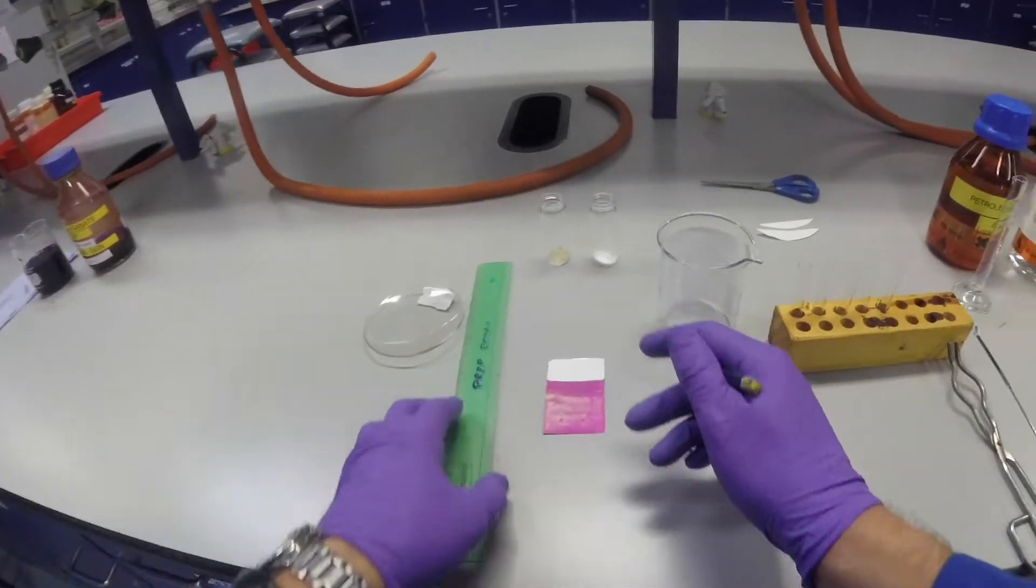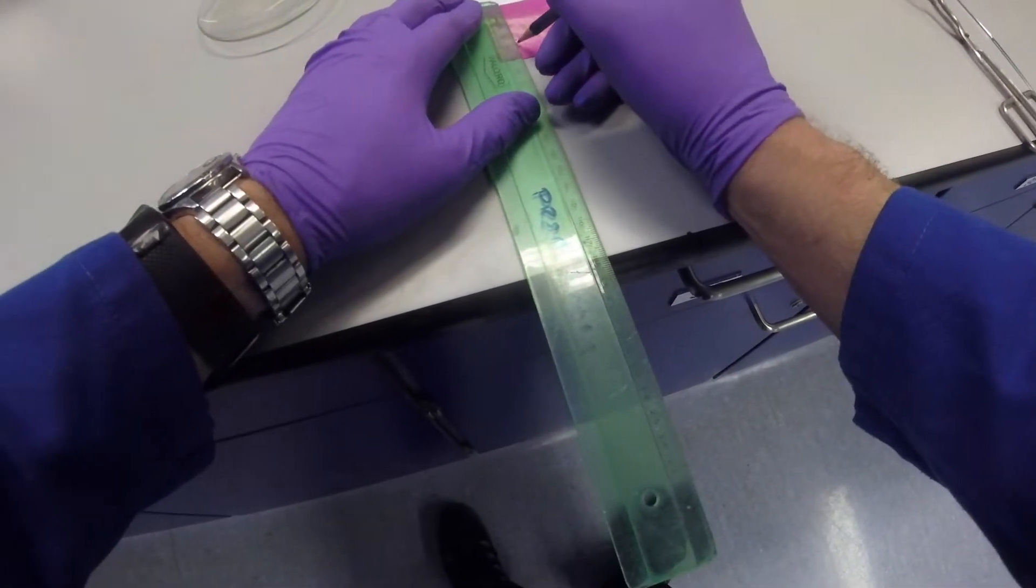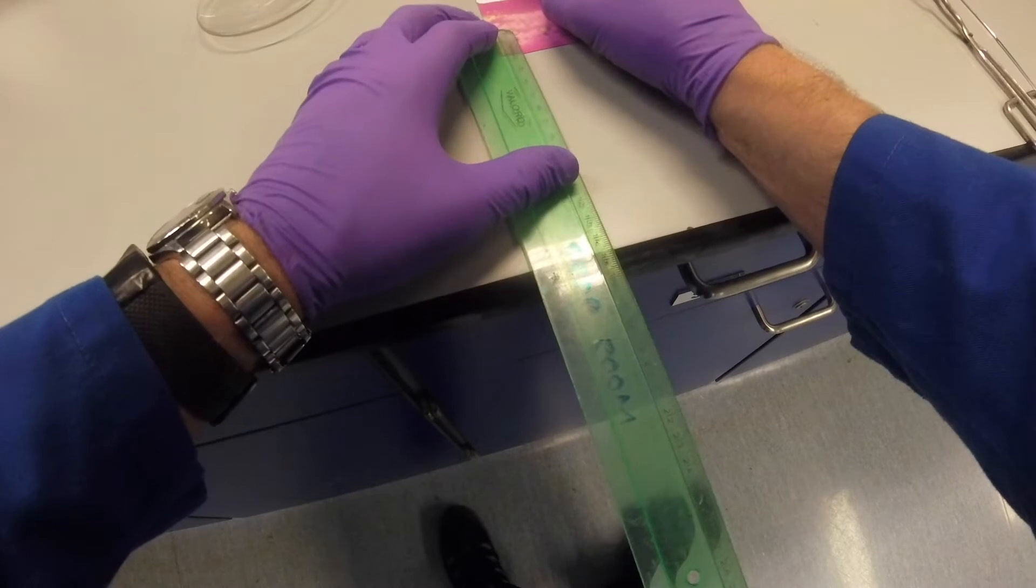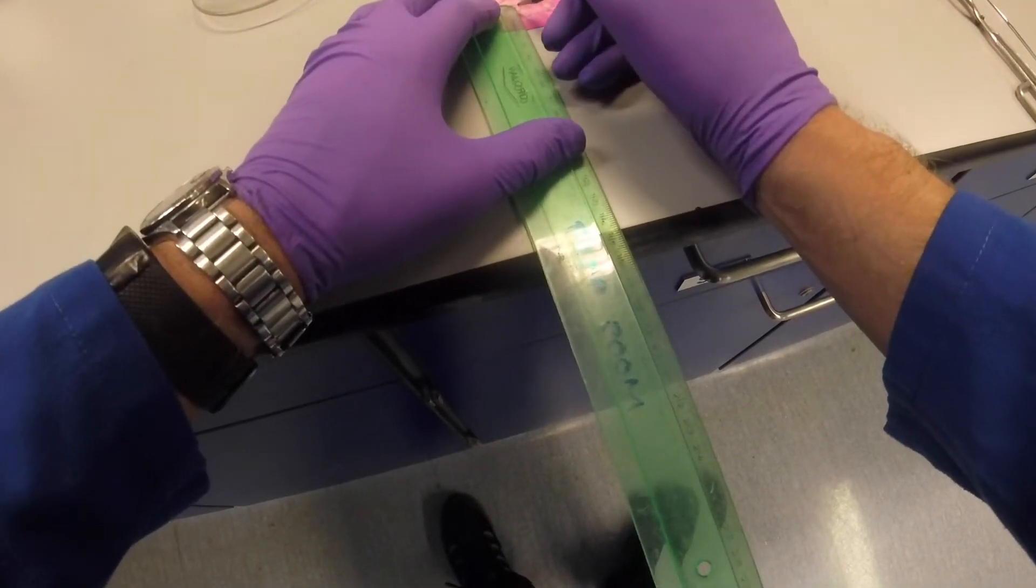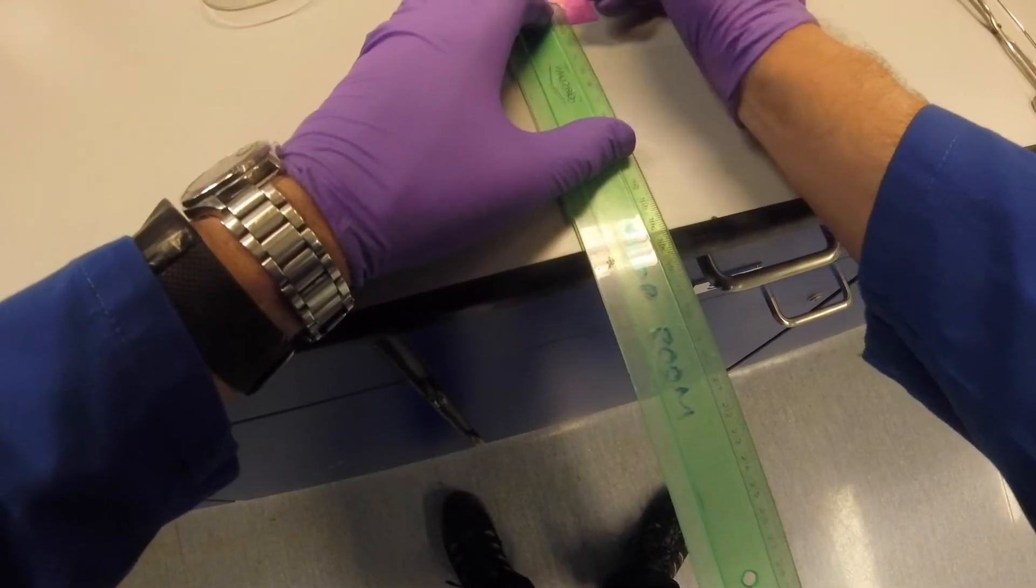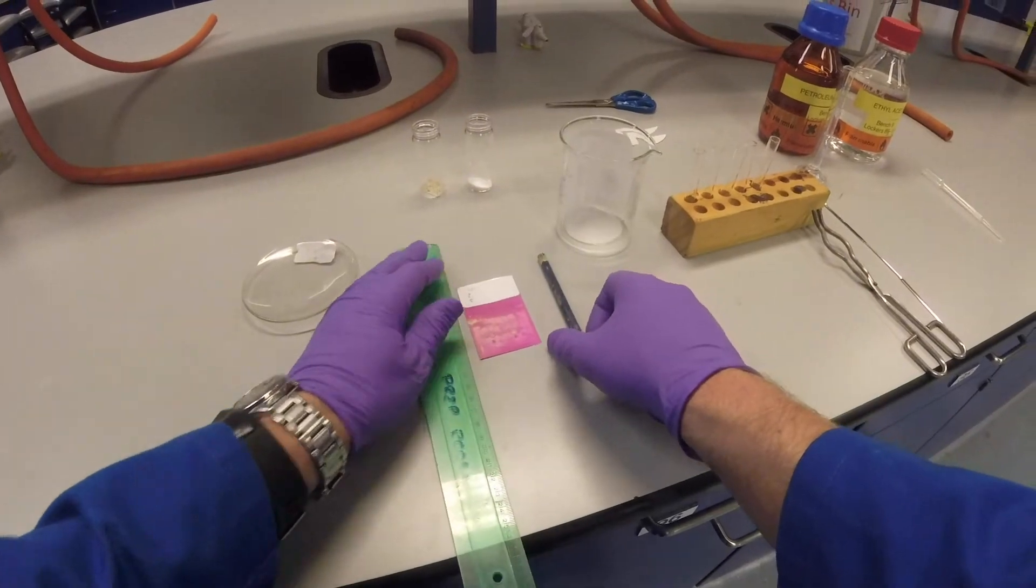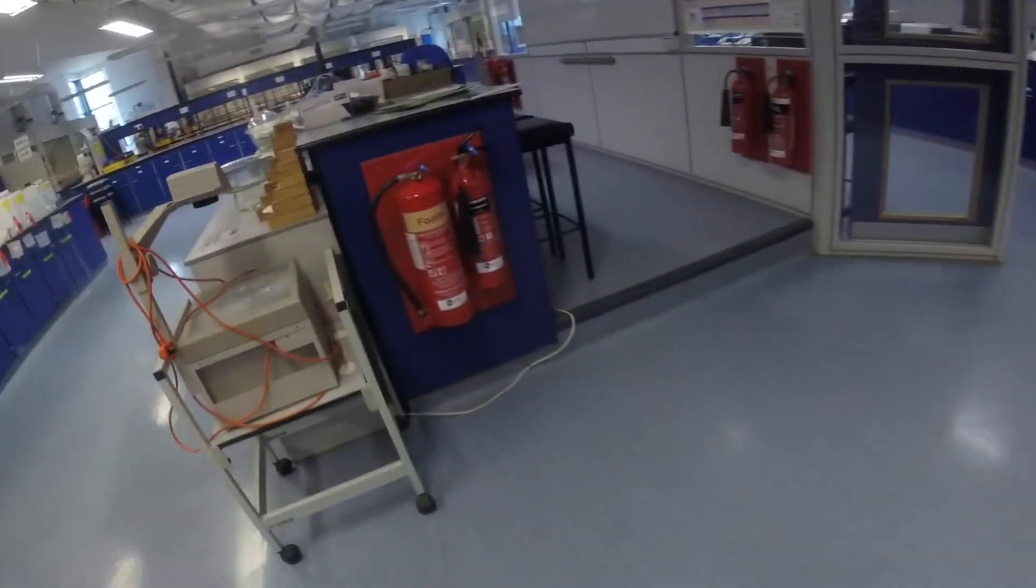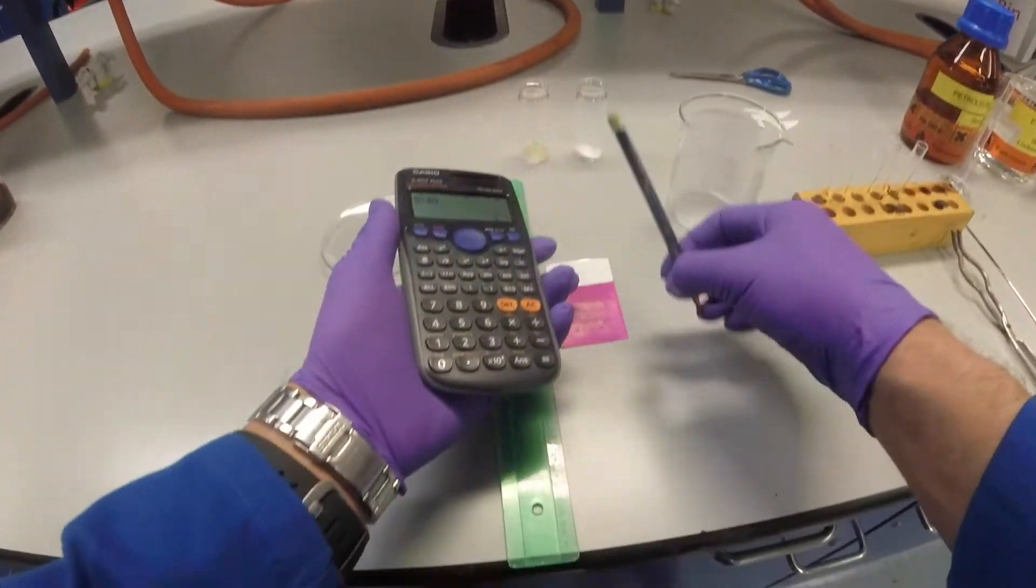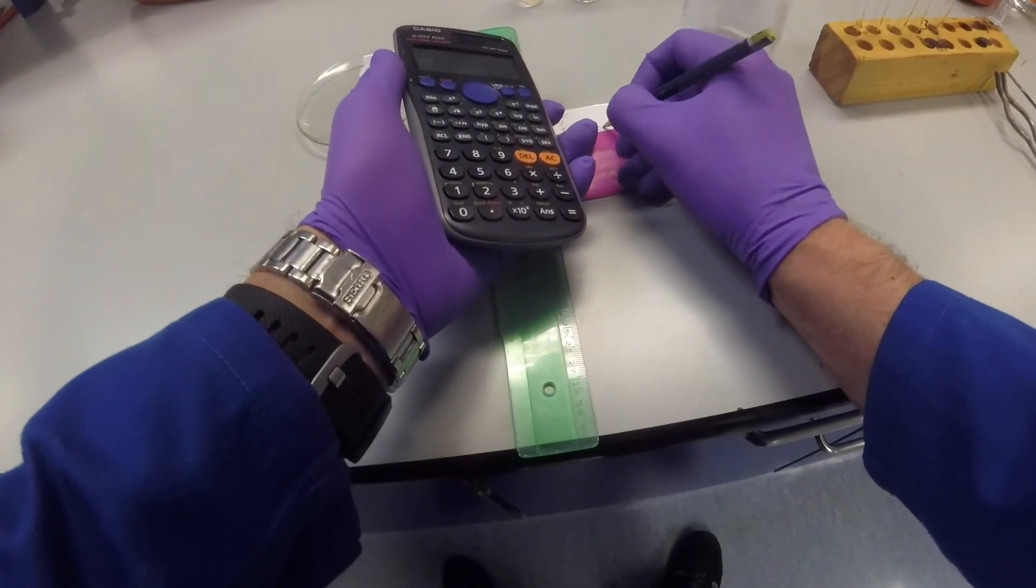That can be used as a record. The final thing we need to do is work out the retention factor or RF. To do that we measure the distance from the baseline to the solvent front, so in that case it's 40 millimeters. We then take the measurement from the center of the spot to the baseline, in this case 8 millimeters and in this case 5 millimeters. The retention factor for this one is 8 divided by 40, and the retention factor for this one is 5 divided by 40. You note that RF is a fraction of a whole. The retention factor for the first spot is 0.2, and the retention factor for this spot is 0.125.